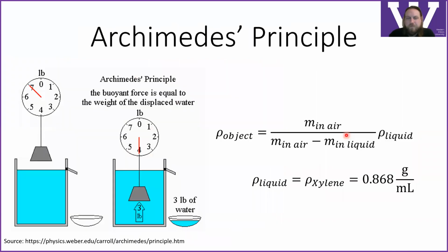The first thing that we measure after making these samples is density. We do so by using Archimedes' principle. Our samples aren't in a nice geometric shape that we can just measure the radius and the thickness and all that and get a density that way. So we have to use Archimedes' principle.